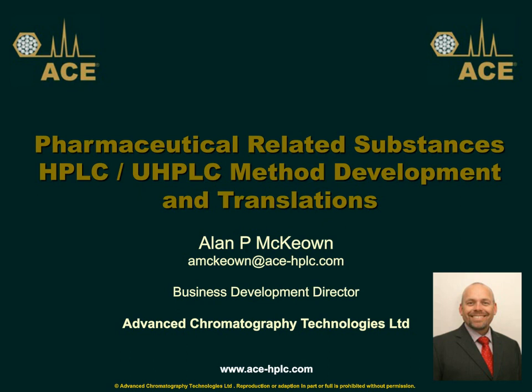But for everybody still listening, I absolutely recommend that you check with whatever pharmacopoeia you're wanting to test to, whether it's the USP, the JP, the CP, the Pharmeuropa, the BP, whatever it is, and check with the chromatography general chapter in that particular publication. But I'm pretty sure for gradient separation there isn't much flexibility. My understanding, from talking to the people on the committee who make these changes, is that there are discussions about how we can use modern technology and modern particle platforms for gradient analysis and monographs as well, but it's not quite there yet.